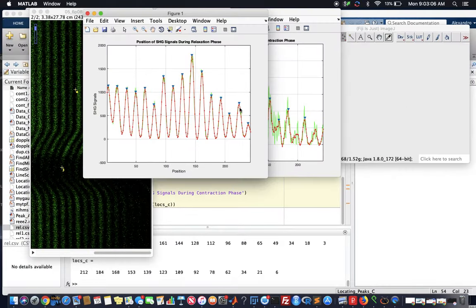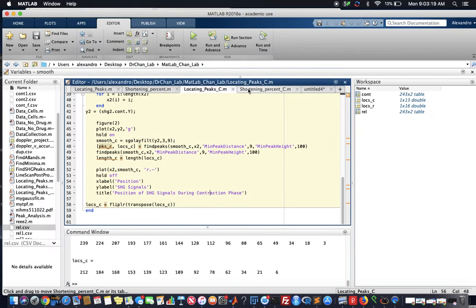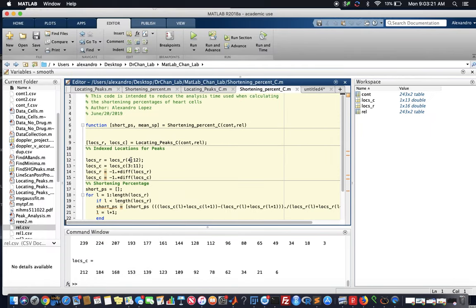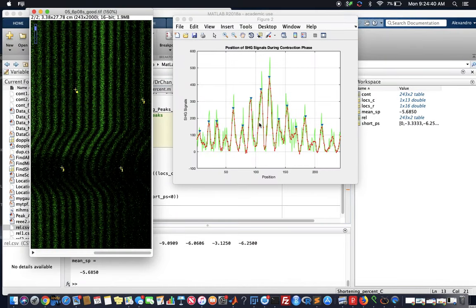So let's see if this, okay, so then this band here, it's a little hard to see, is counted, so we're going to be starting off from 2. Be 2, 3, 4, 5, 6, 7, 8, 9, 10. So 2 to 10. Alright, so once again, you go here, locations are. Go back here. Alright, so we had said 1, 2, 3, 4. So 1, 2, 3, 4.